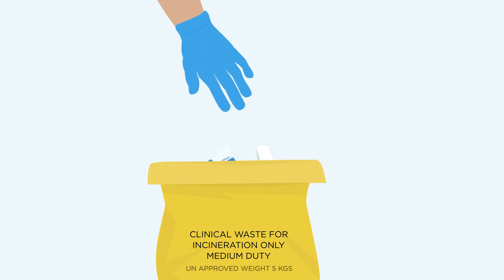Dispose of removed materials, used absorbent pads and wipes in bag provided.